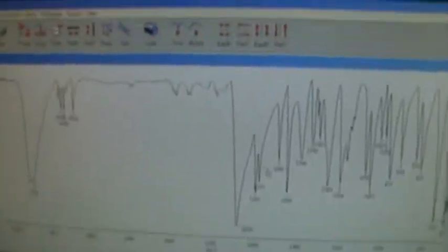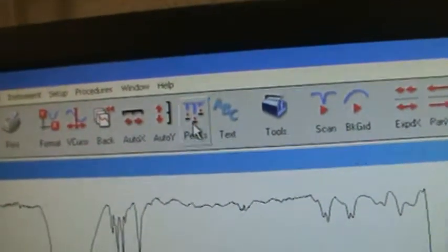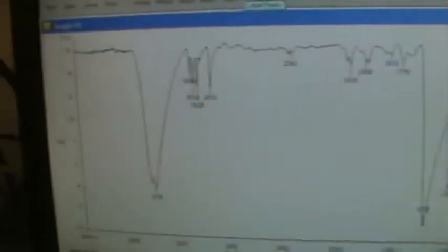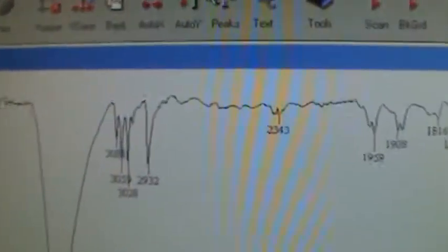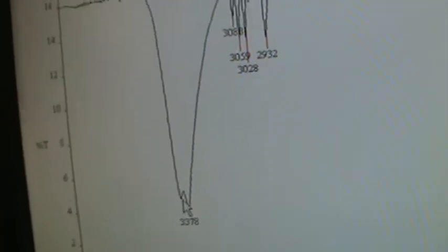This is still the same peaks it was before. So this is the trick. You have to go back up into label peaks, click it once, it takes the labels off, click it again, and it puts the new threshold setting in. So notice how before this peak right here was not picked. It is now. These ones are picked, but this one over here is still not picked.